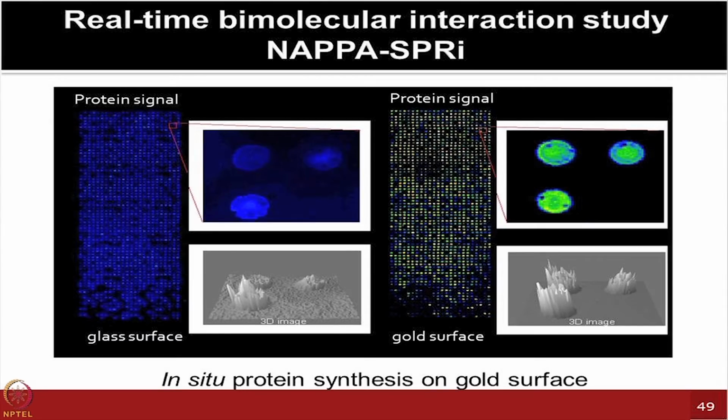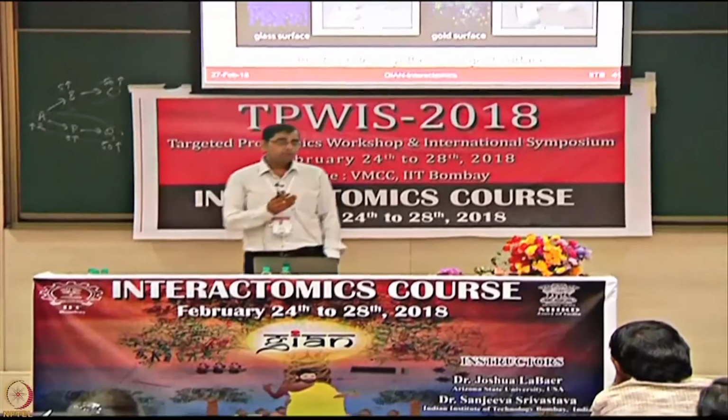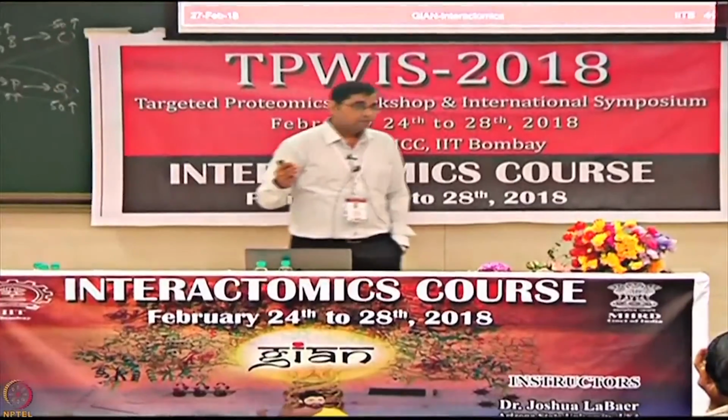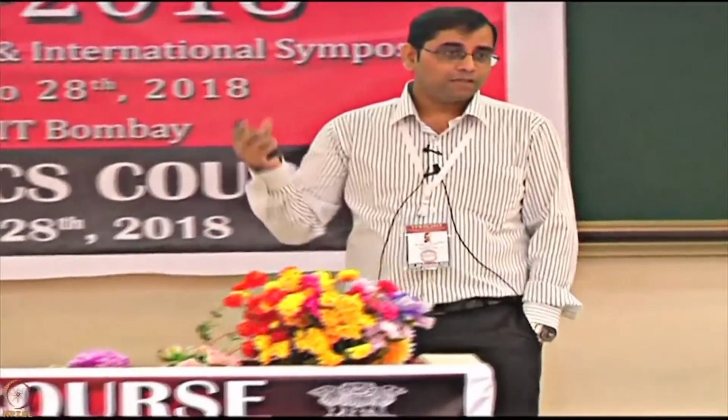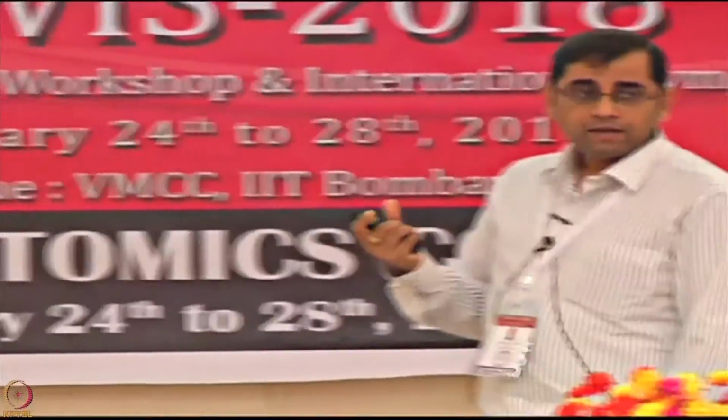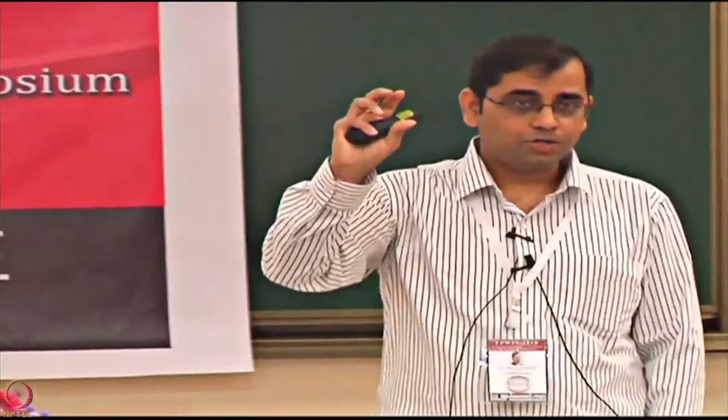But the traditional NAPA chemistry, which you are aware of, has many components in a master mix, which included BSA, BS3 cross-linker, the capture antibody, and of course your clone of interest, the cDNA of that, having a GST tag. So all of them were making the whole mass too much, which you are adding on a given chip surface.